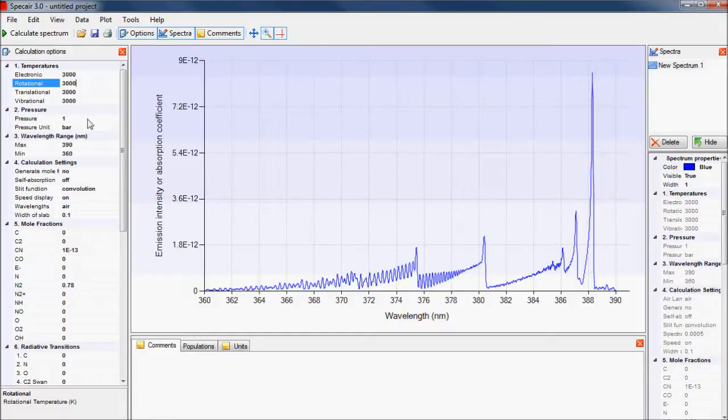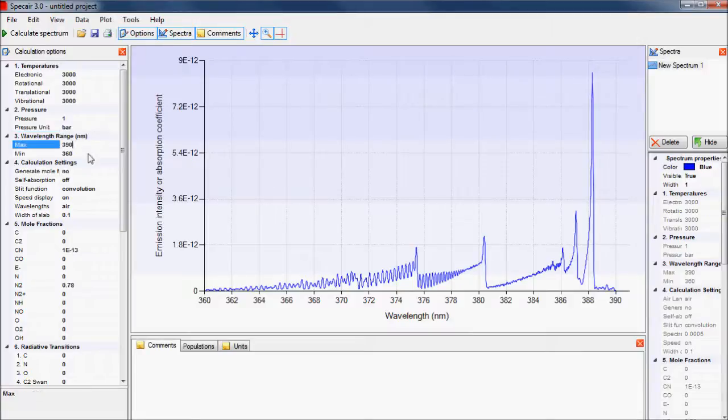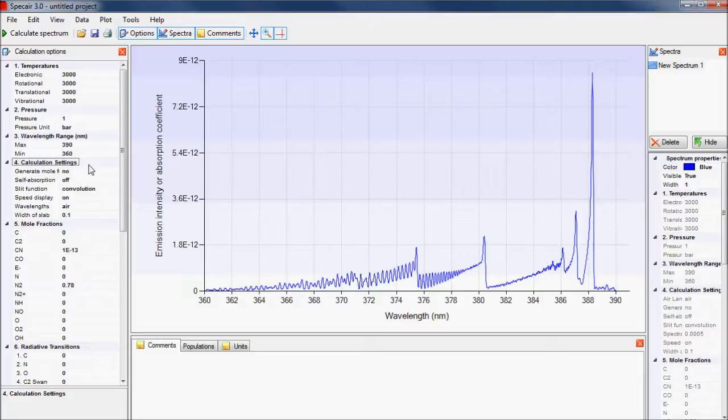Next is the pressure of the gas and the unit, followed by the wavelength range that is used in the calculations. The calculation settings contain parameters that pertain to the calculations in SpecAir.